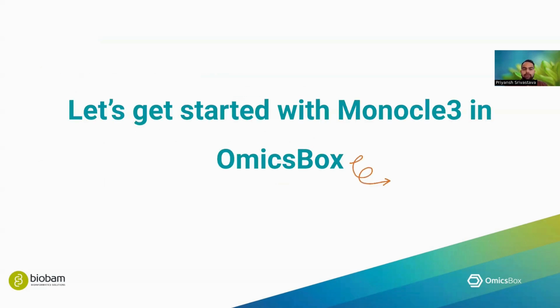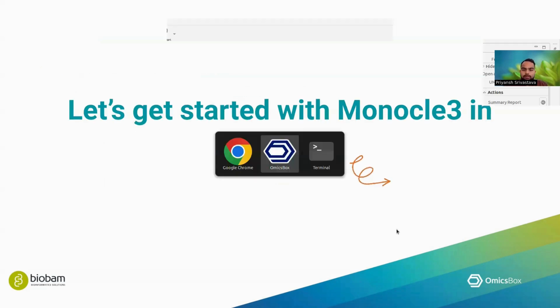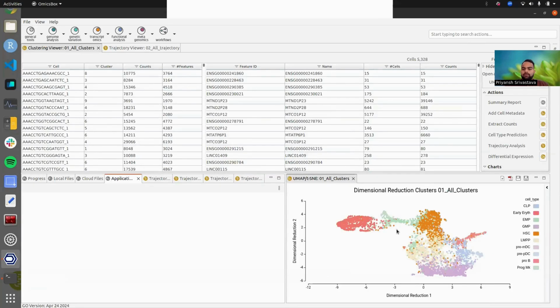So without further ado, let's get started with the OmicsBox. Since you already have some idea about the interface of the OmicsBox from the previous presentation, I'll just quickly go through. This is the result from Seurat clustering. What you have here is each of the cells, and their barcode is represented here. Then you have the cluster, which is assigned by Seurat to them. And then we have other information about the features and the count. Then this is the UMAP that we just saw.